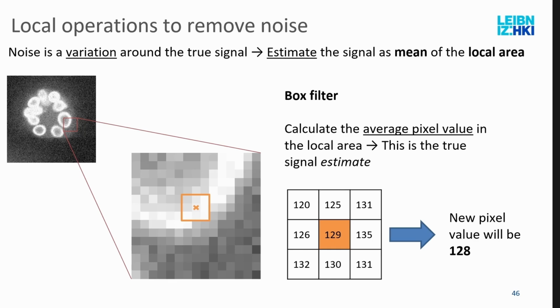Sometimes they assume, okay, outside is 0, but then it will pull the average down on the elements on the side. Then, for example, this will be darker here because it sees, oh, this is outside, it's 0. Sometimes they don't calculate it in, then it will weigh the local pixels more. Sometimes they will mirror the image, so when we have pixel values 1, 2, 3, it will mirror them 1, 2, 3, like that, which also has its benefits and disadvantages. Sometimes they will make it periodic.